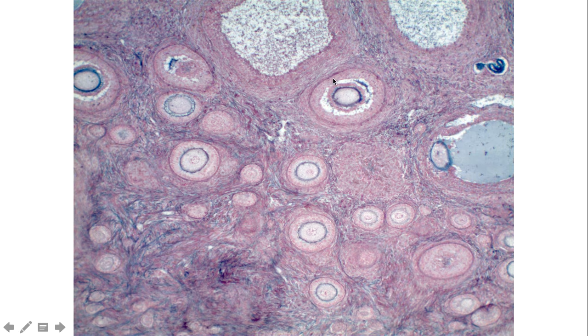Outside the antrum is then another layer or layers of granulosa cells. So the granulosa cells in the middle are now called the corona radiata, whereas outside we continue to call these the granulosa cells. You'll also notice there's this layer of dense tissue, almost like a solid band that wraps around it. These are called the thecal cells. So the outer layer that surrounds this entire follicle is the thecal cells.